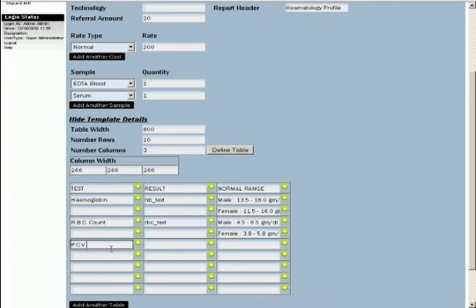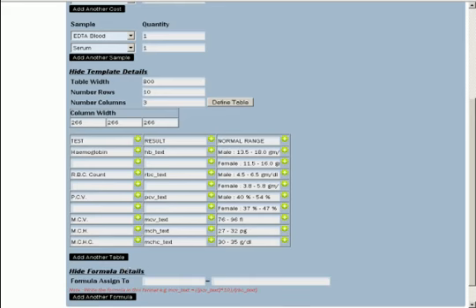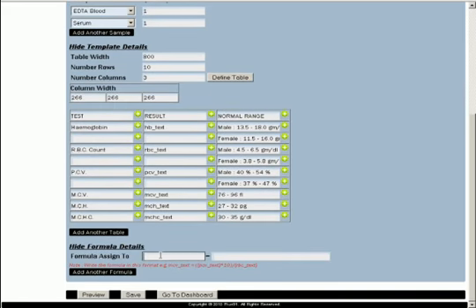Apart from defining the template, in the newer versions of LabC, you will also find that you can define an SMS template for each report template, using the values under result or using the labels under result to actually define the values and allowing them to be picked up automatically. Once you have finished entering all the values with the blank spaces in between, we can see a preview and see how much has been done. You can also add multiple tables, one below the other, which will come as different grids in the printout.